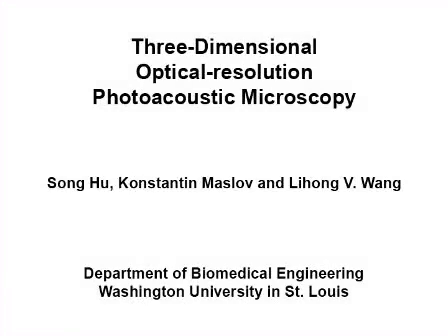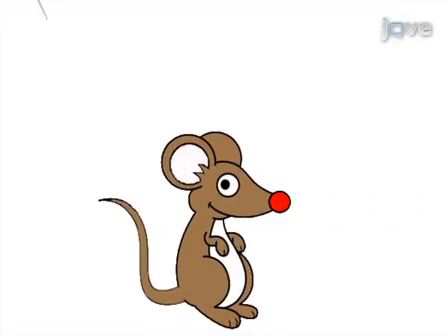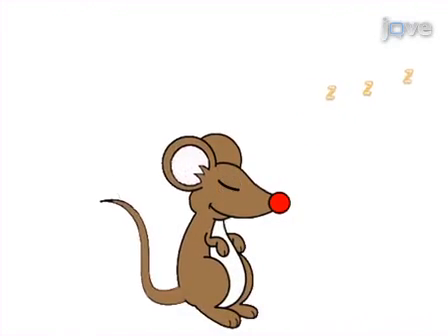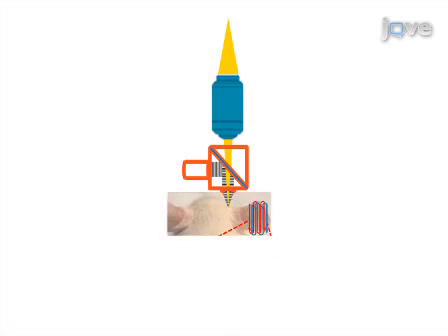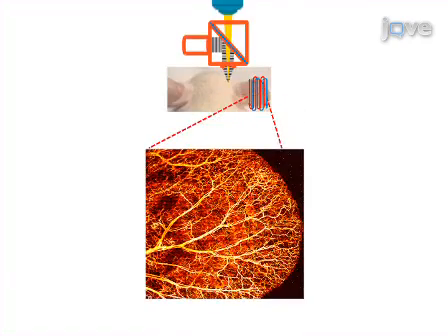The overall goal of this procedure is to demonstrate in vivo optical resolution photoacoustic microscopy, or ORPAM, of microcirculation that is non-invasive and label-free. This is accomplished by first anesthetizing the experimental animal. The second step of the procedure is to position the region of interest by translating the imaging head of the optical resolution photoacoustic microscope. Scanning parameters are then set and image acquisition is initiated.